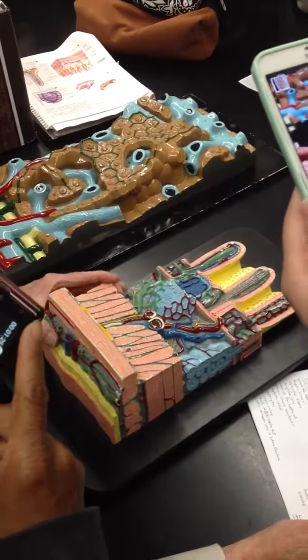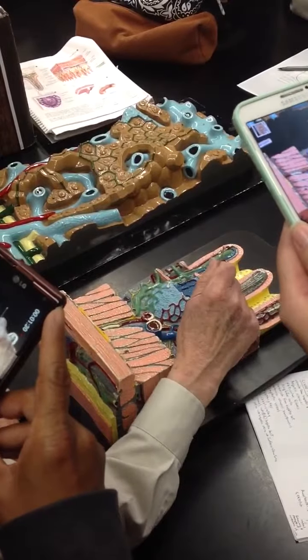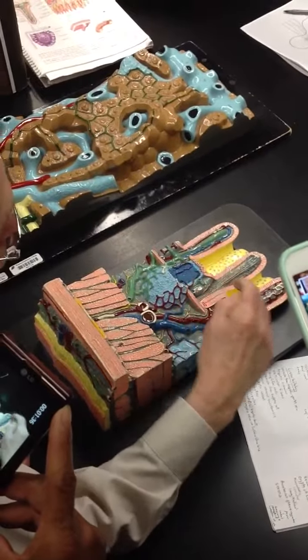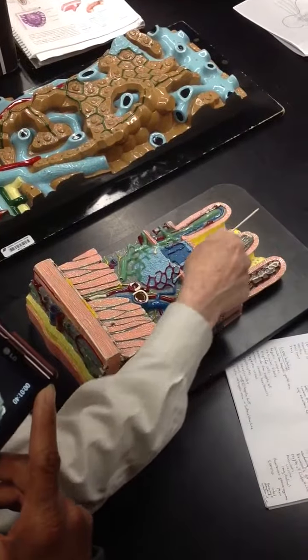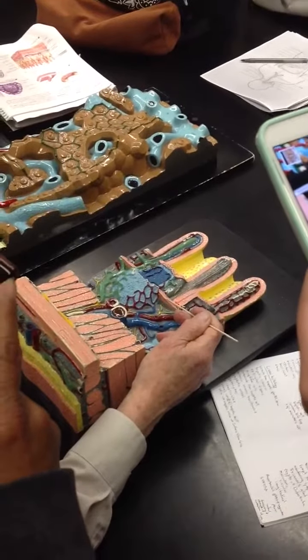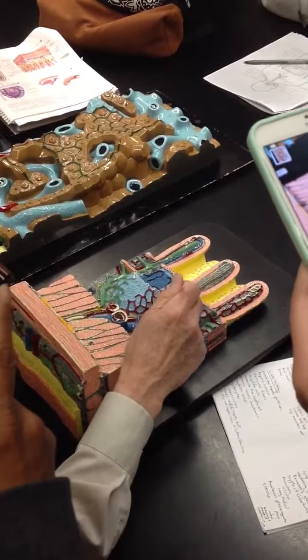Muscularis mucosa. This thin muscle layer right here, very thin muscle layer, is the muscularis mucosa. It's in the mucosal layer, which you remember I told you is the first layer you encounter as you worm your way through the wall of the intestinal tract from inside to outside. Notice that the muscularis mucosa sends fibers up into the villi.